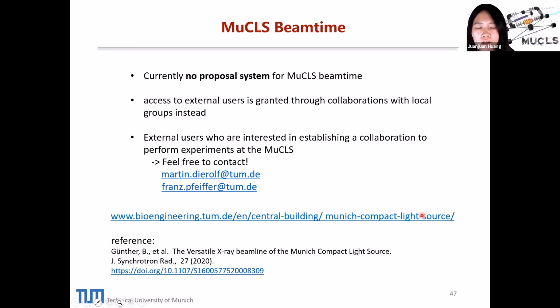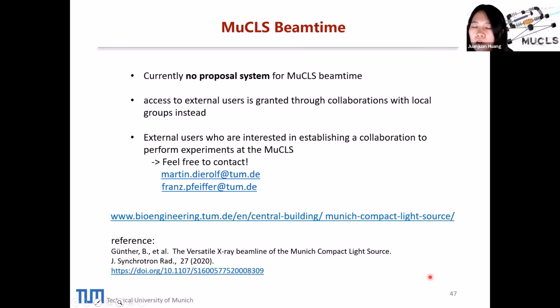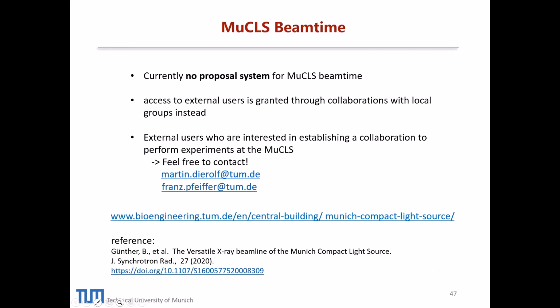So, one of the potential advantages of a laboratory system is that you can run a sample or an experiment for a month at a time or several weeks at a time. And you showed one slide about stability. Have you looked at doing any data at lower concentrations, and if you build up statistics, does noise cancel out as you count for a low concentration sample for a week or so, or is there some other instability in the data collection?